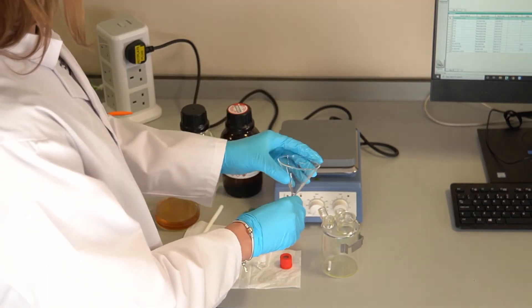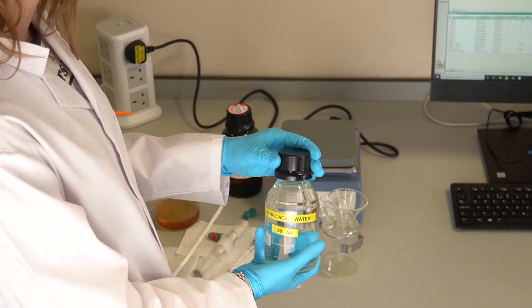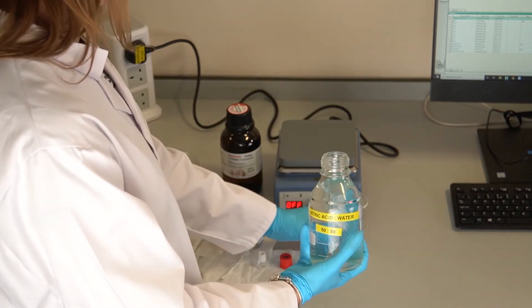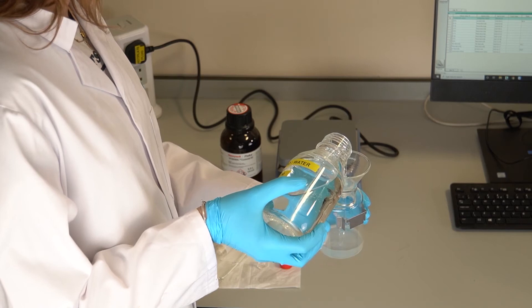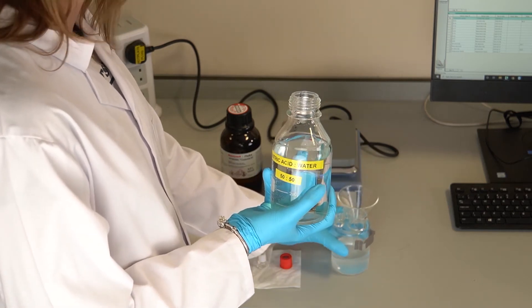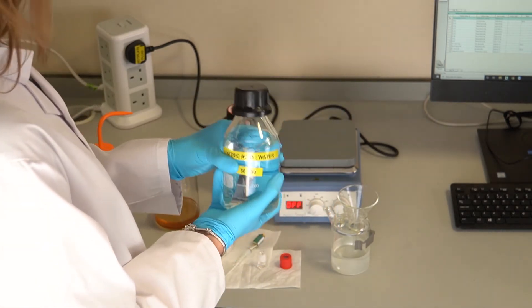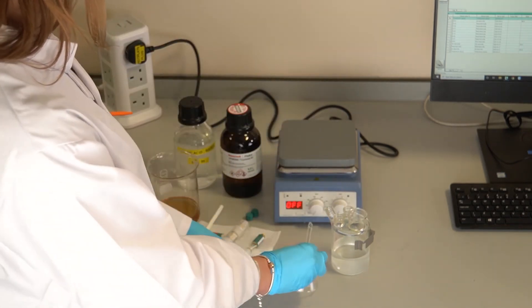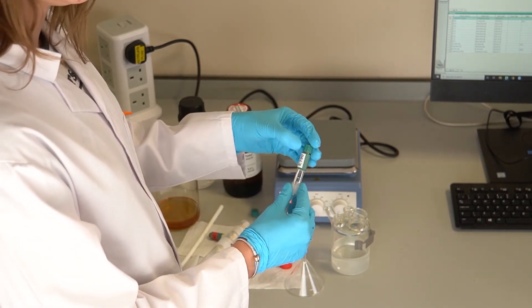Remove the stirrer bar and Karl Fischer reagent from the cell to allow cleaning. Add a 50-50 mix of nitric acid and water, mount on a stirrer plate, and stir for 15 minutes. Protective caps should be added to the electrodes during this step to protect the connections from corrosion.